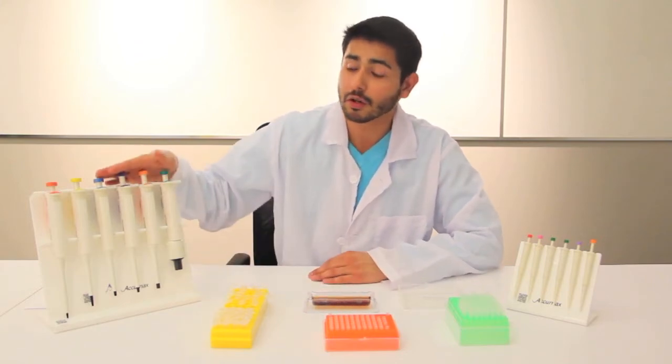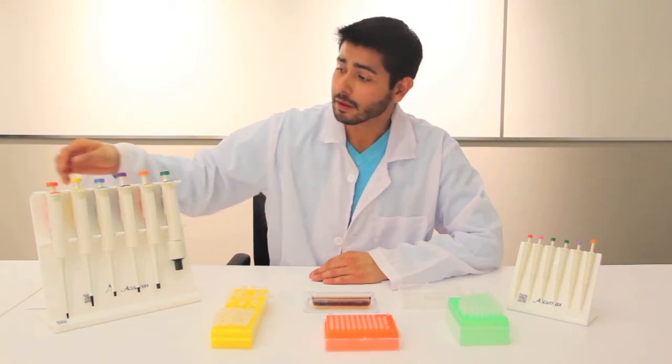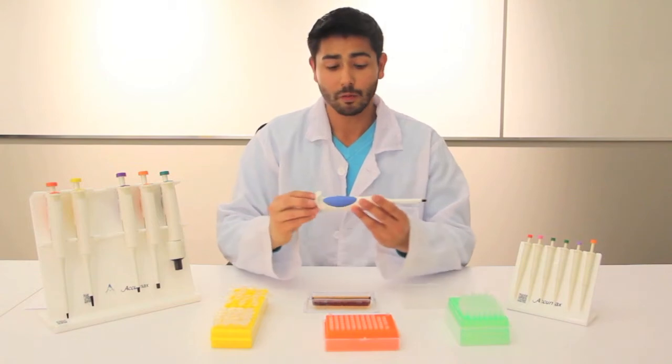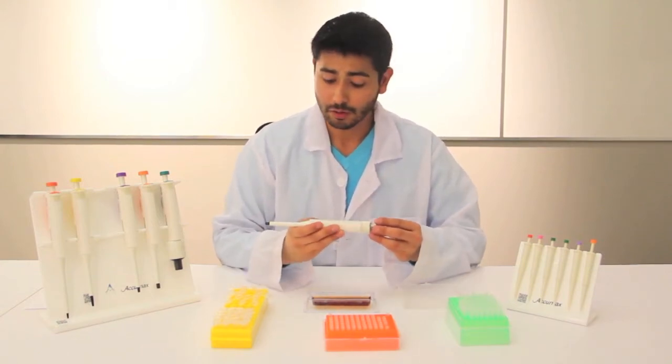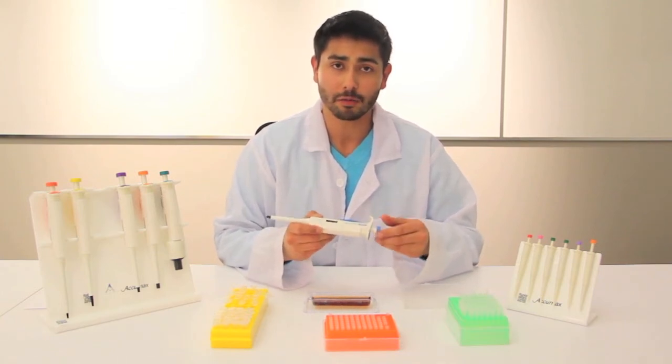I do want to show you and compare the AcuMax Juniors to the AcuMax Pros, the more traditional pipettes. Comparatively, these pipettes are much larger and they come in a larger range of volumes. One thing that's different about these pipettes is that they are variable volume — this one goes from 10 microliters to 100 microliters, and you can switch the volume just by turning the knob.